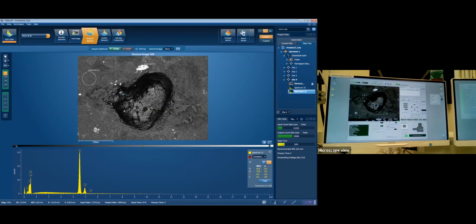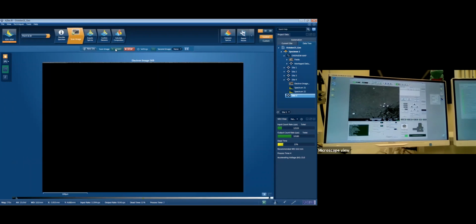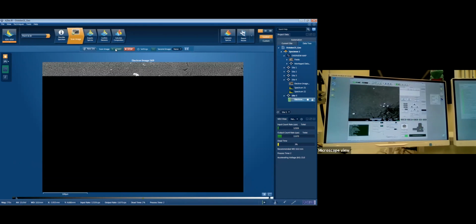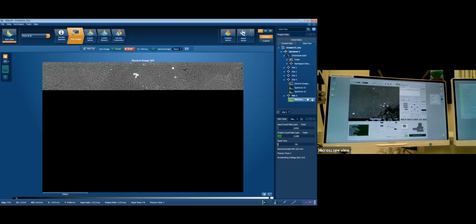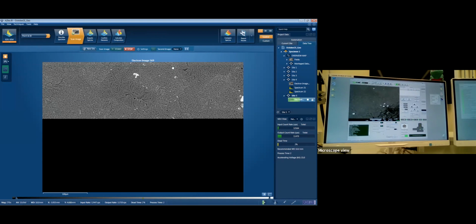That's okay. Could we do a zoom in on some of this fuzzy texture and get an idea of what's there? Yeah. So we're going to zoom in. I think we're kind of like in this area. Yeah, that'll do nicely. And what we'll do is we will. Oh, you're fine. Yeah, it's weird, isn't it?